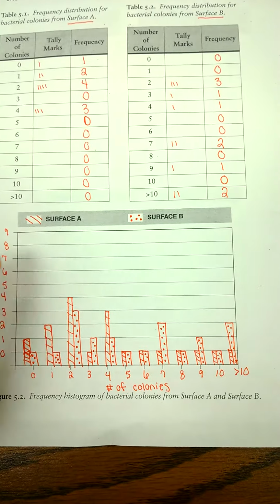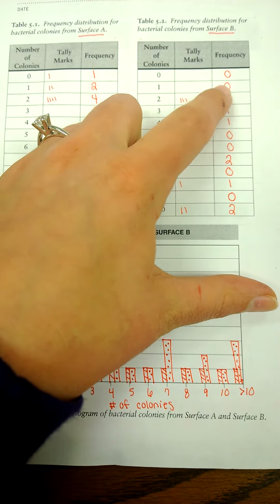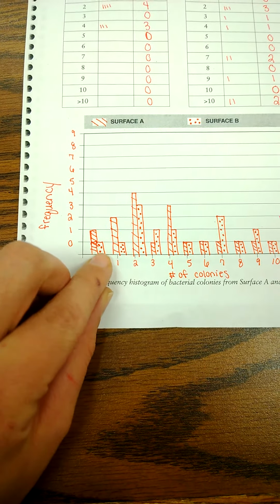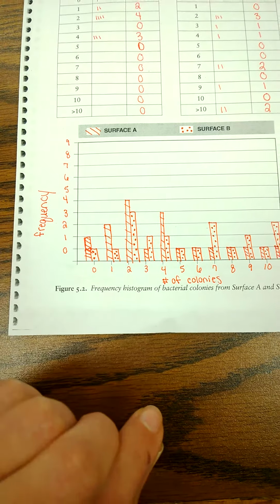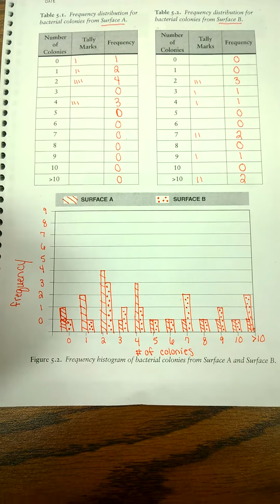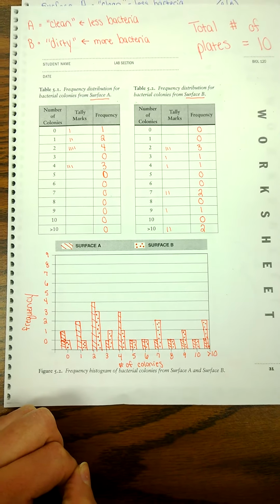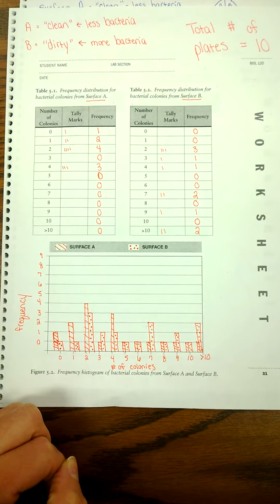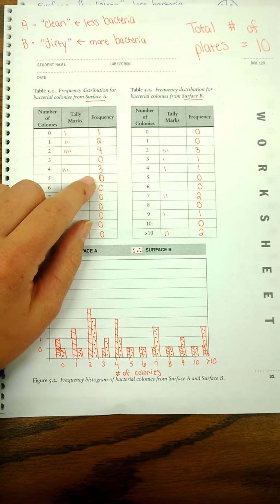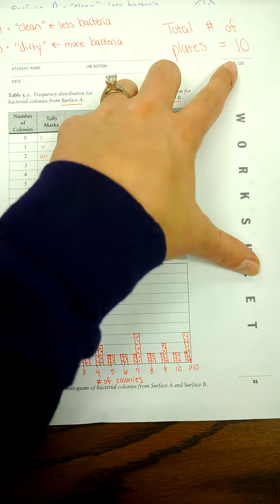What about side B at 0 colonies? At 0 colonies on side B, I had a frequency of 0. So back here to my graph, for surface B, I can graph a frequency of 0. You will do this all the way from 0 to more than 10 colonies to complete your histogram. Keep in mind that for those of you that were not able to come to a makeup lab, I am giving you these numbers to use. The total number of plates that we're using to create this histogram is 10.